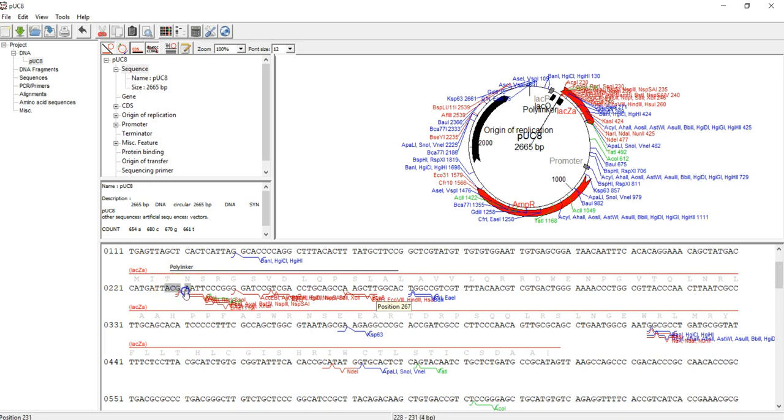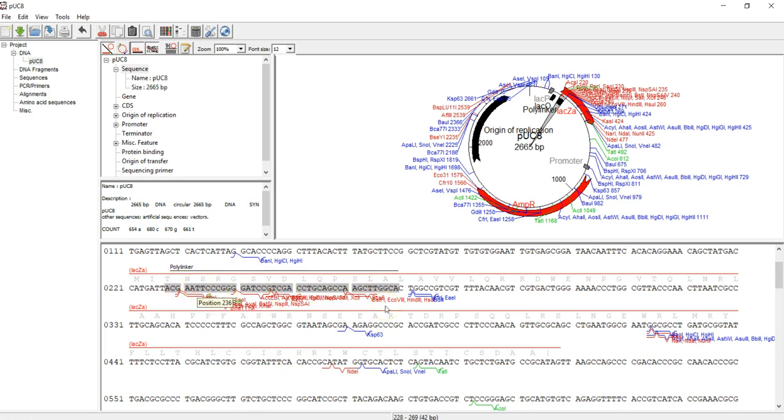So let's see how to select specific restriction enzymes that we're interested in. We're going to focus on the polylinker region because those restriction enzymes within the polylinker region should be specific to this region, which means there's only one cutting site within the polylinker region. These are the ones going to be useful for cloning process.